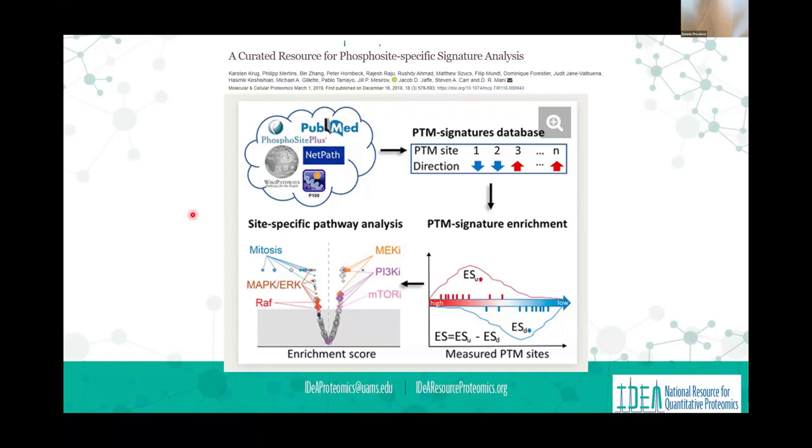Any artifacts from the enrichment are really kind of thrown out the window, because however variable that enrichment process is, and remember, it's not a true enrichment, we're just kind of hijacking some coordination chemistry, however irreproducible that might be, in that one experiment, it's the same for all those peptides. And so their response is going to be the same.